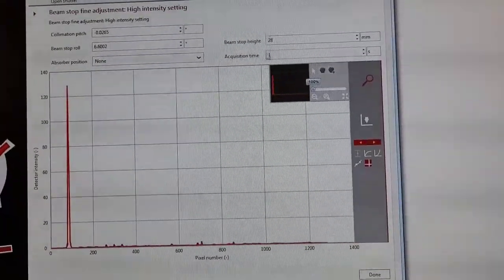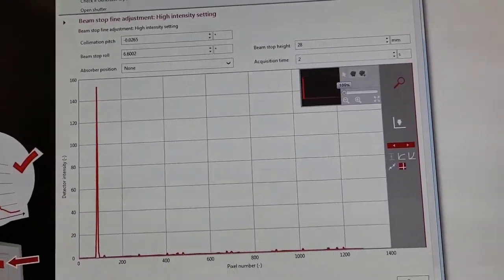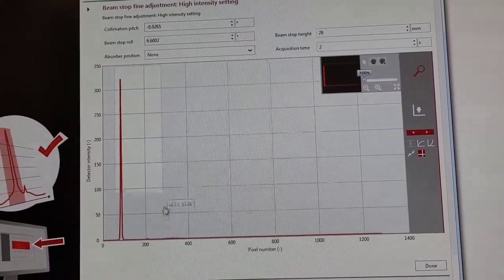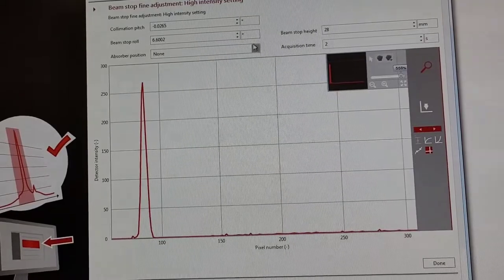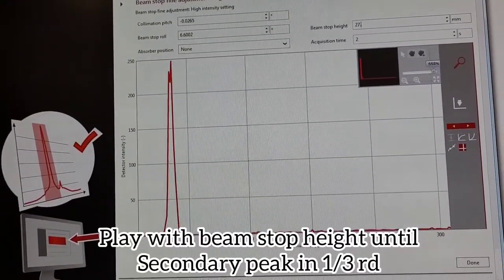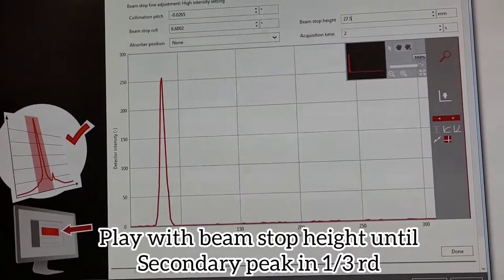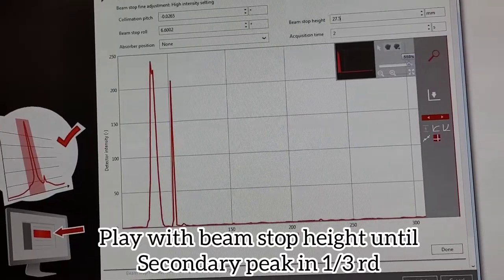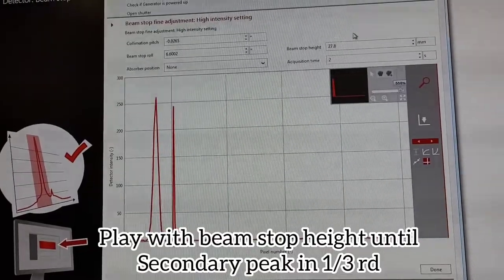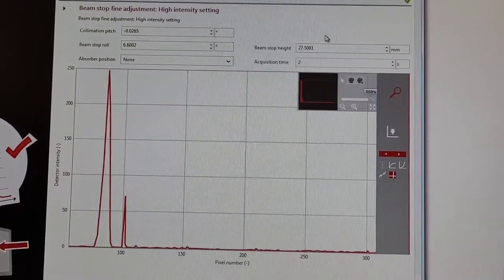You follow these steps. You first do alignment for high intensity setting and then a high resolution setting. Put the absorption at none, the acquisition time at 2. Then you play with the beam stop height until the secondary beam is about a third of the primary one. Once you do that you select okay and go ahead and do exactly the same thing for the high resolution setting.